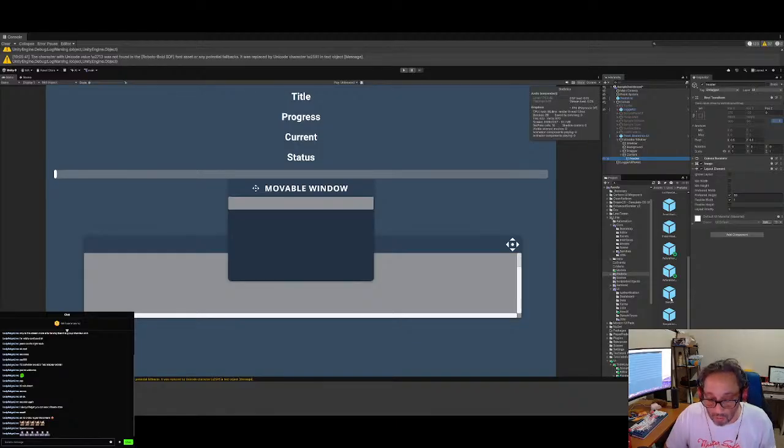Now, if you know your rows that you want to do, I'll bring this up. Okay, we want to do, hold on a second. There we go. We want to do the window capture. So if you know your database, right?